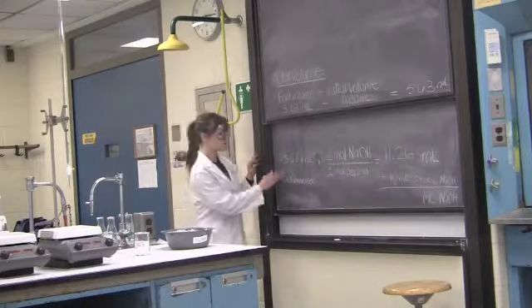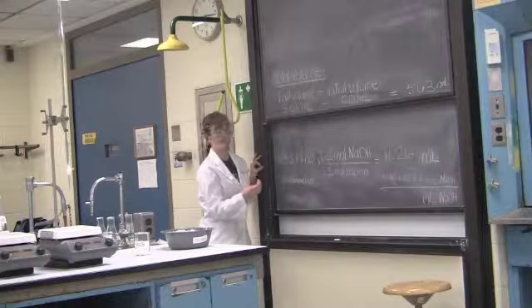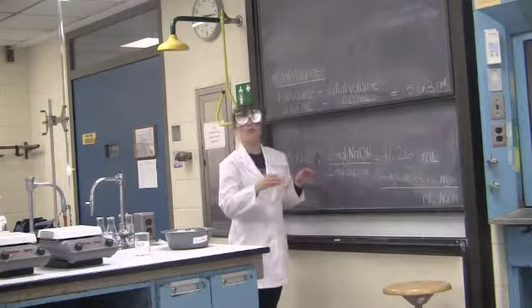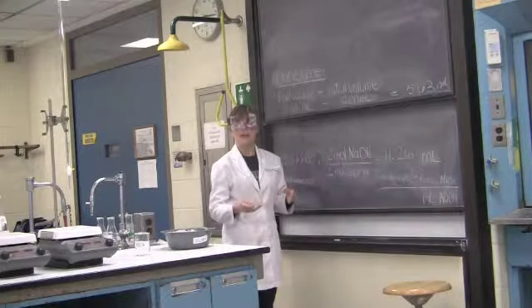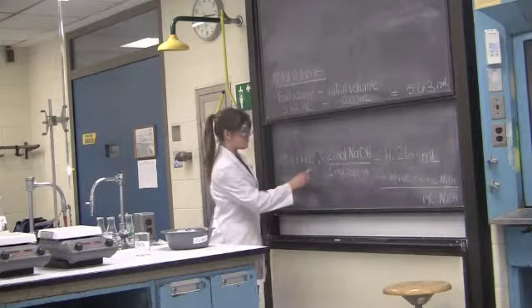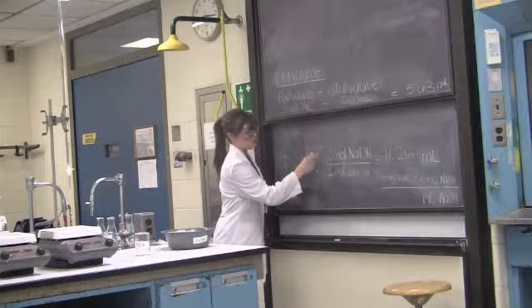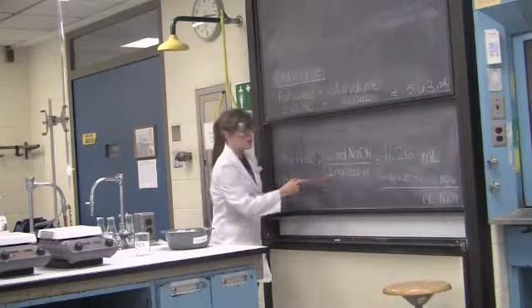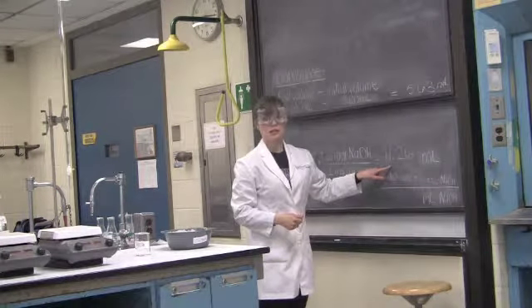Now, we're going to take our total volume, 5.63 mLs, and account for the ratio. In the reaction, we have aspirin reacting with 2 moles of NaOH. And so we have to account for this in our reaction by placing 2 moles of NaOH consumed for every 1 mole of aspirin. This gives us 11.26 mLs as our volume.